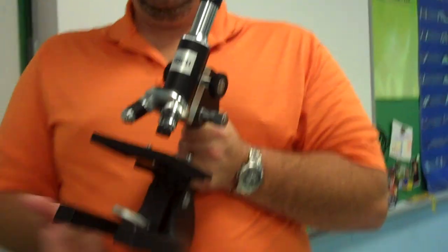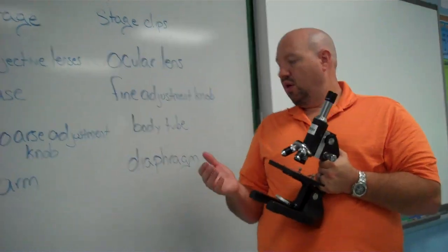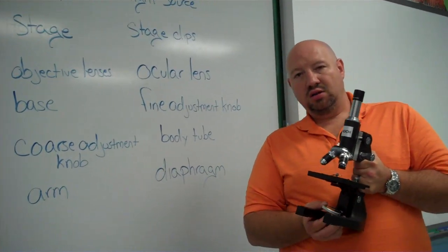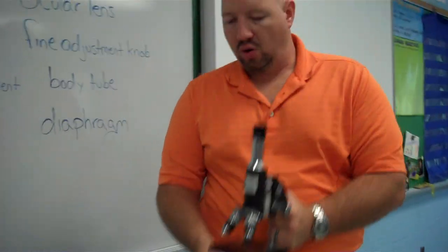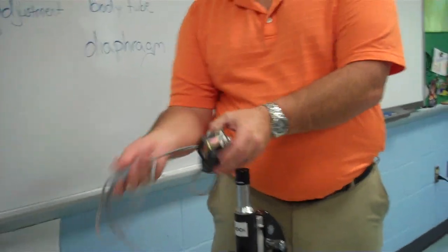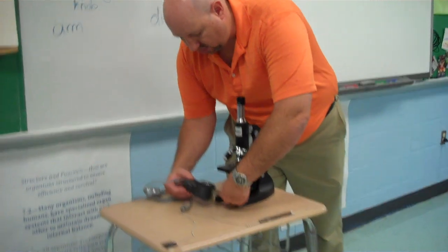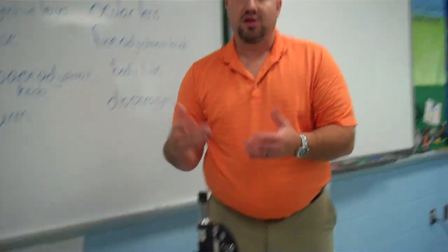Now what you'll be using has two different light sources. We have either a mirror that you just bend the light to get to the body tube. Or we have the electric portion where this plugs into the microscope here and just plug it in. That's how you have the electric light.